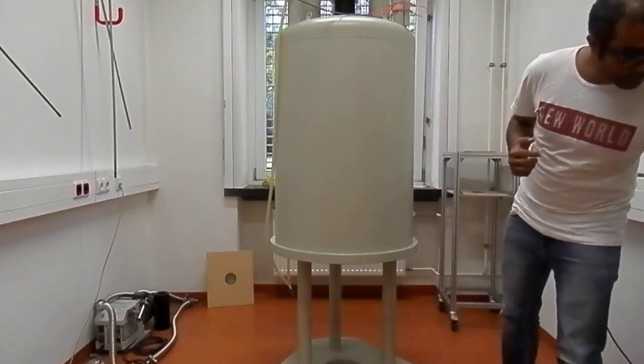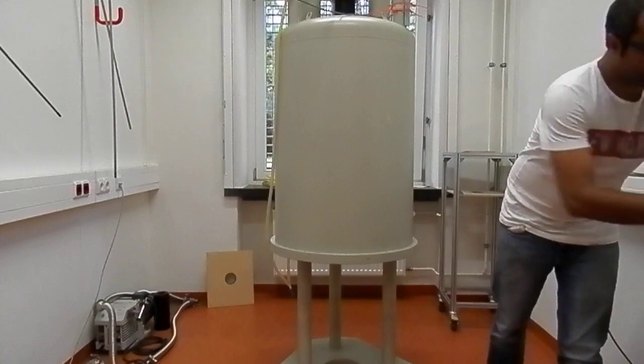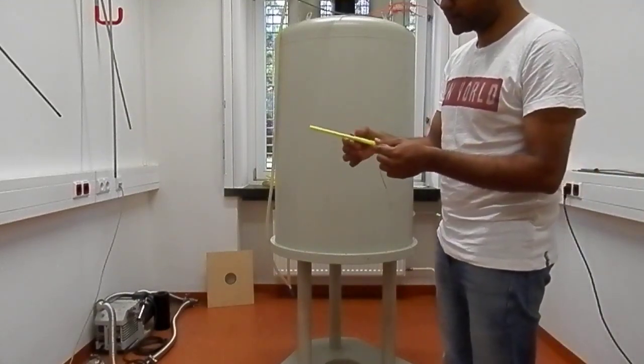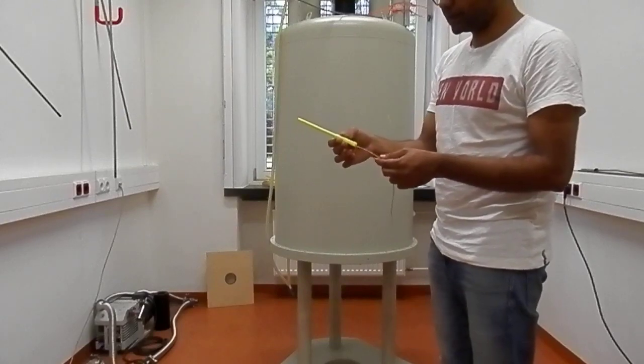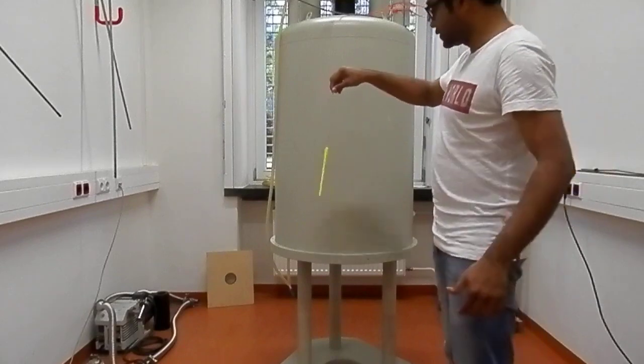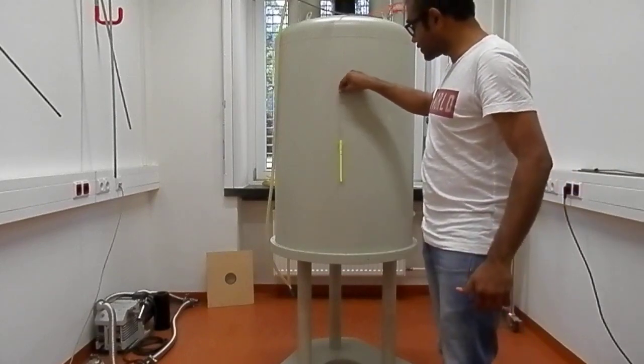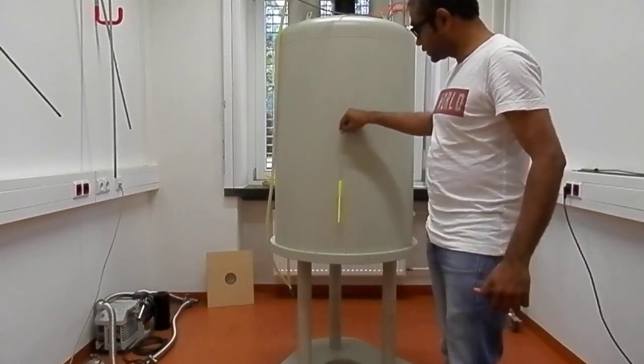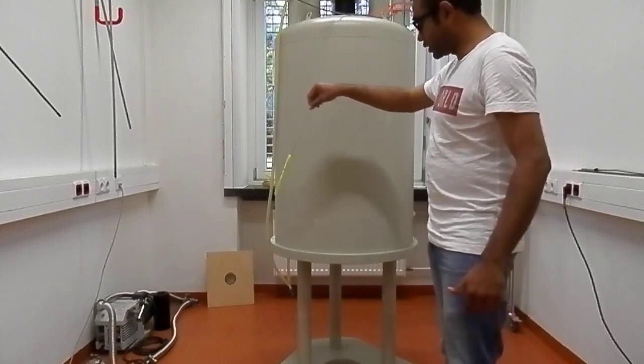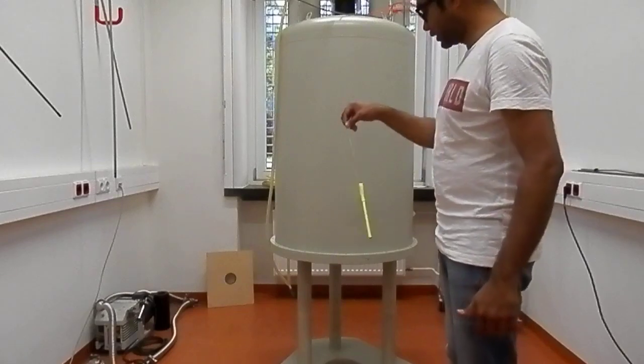First of all, I will take this pen made of plastic. There is no magnetic material inside. I will bring this piece of plastic close to the magnet. You see, nothing is happening. I can do like this or like this—nothing.